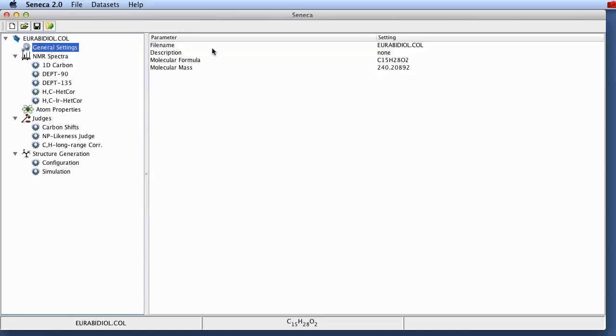General settings contains a file name, a description of the problem, in this case we haven't got any, and molecular formula and a molecular mass.